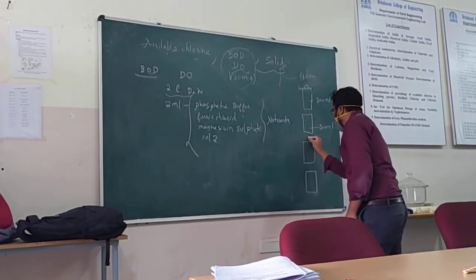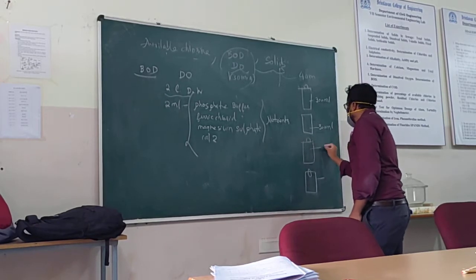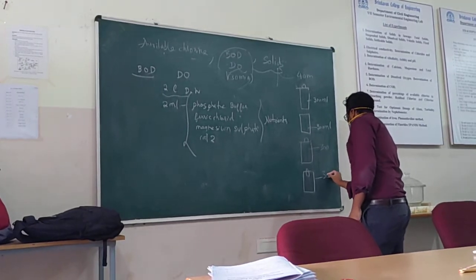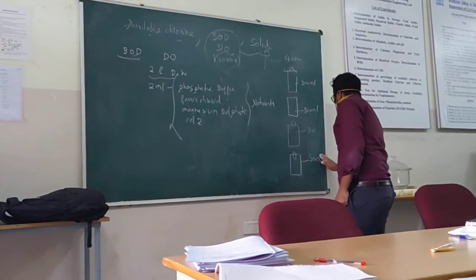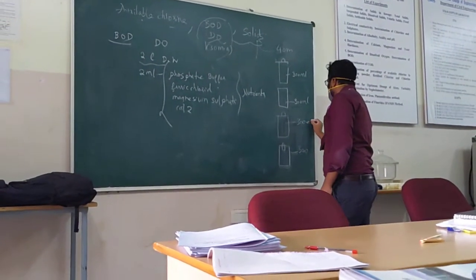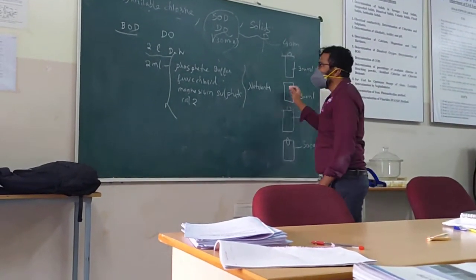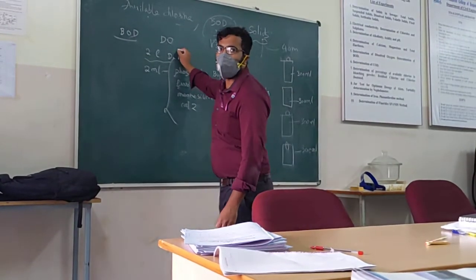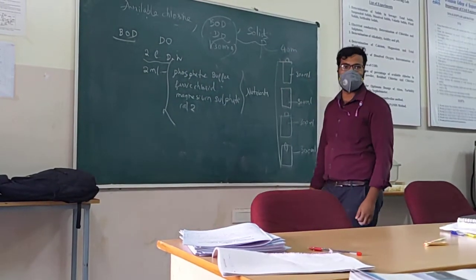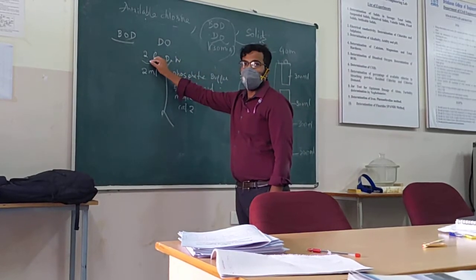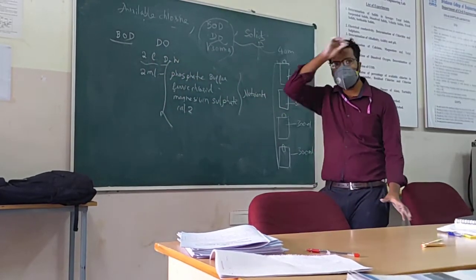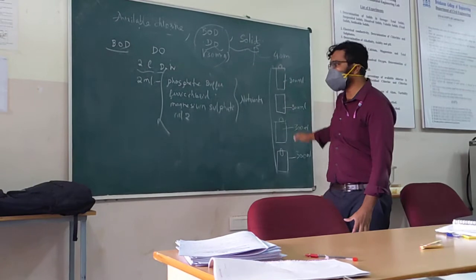So you also know that we need 4 BOD bottles, each of 300 ml. So the total capacity is 1200 ml. So that is why I have taken 2 liters so that I will get almost sufficient amount to fill up all the bottles.